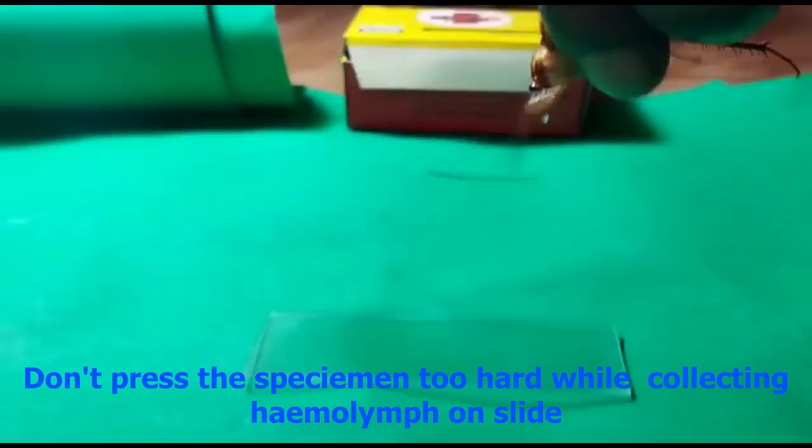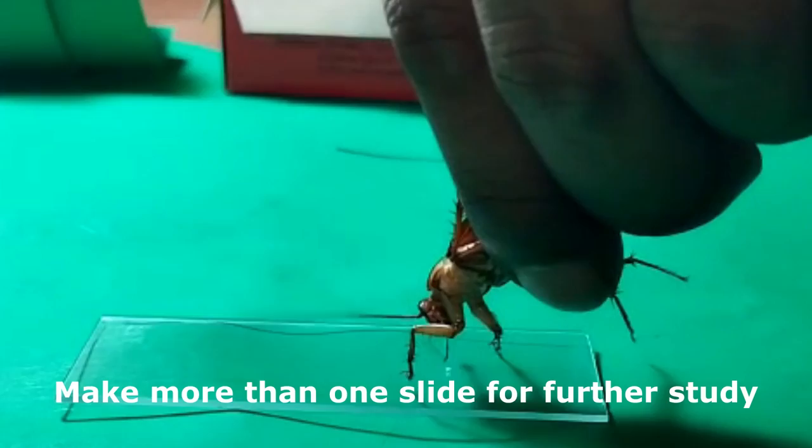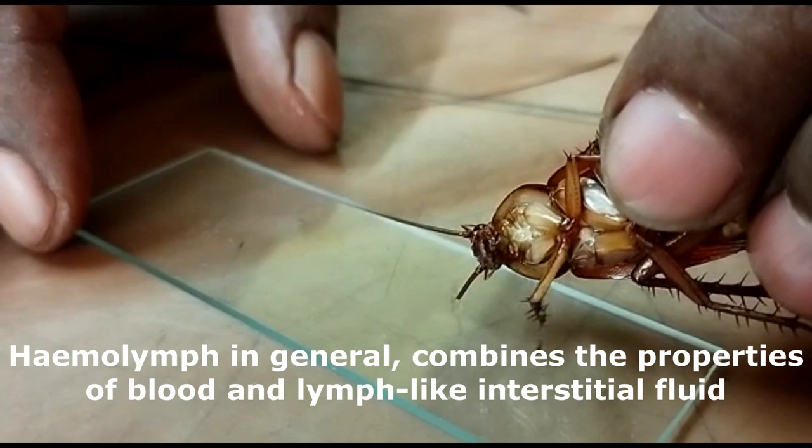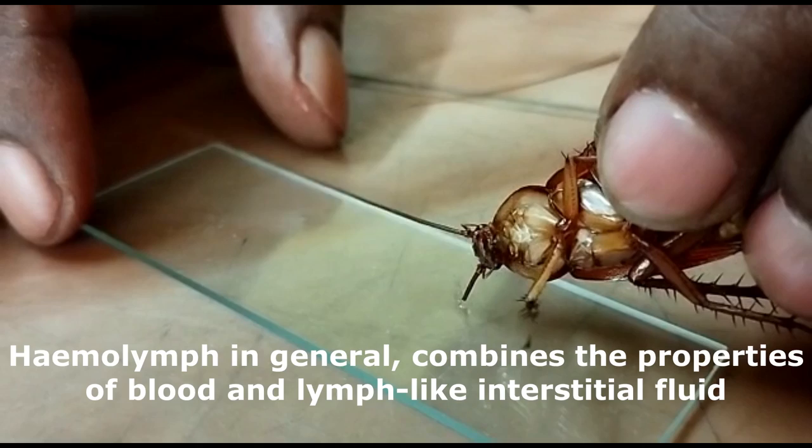Just wait, and make more than one slide for further study. Hemolymph in general combines the properties of blood and lymph-like interstitial fluid. Look at the droplets coming out from the cut end of the antenna. Some may also utilize the femur or leg portion as a source of hemolymph.